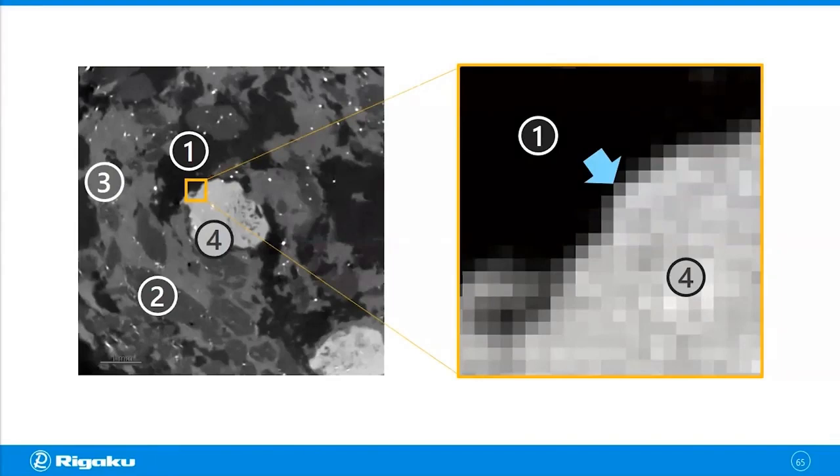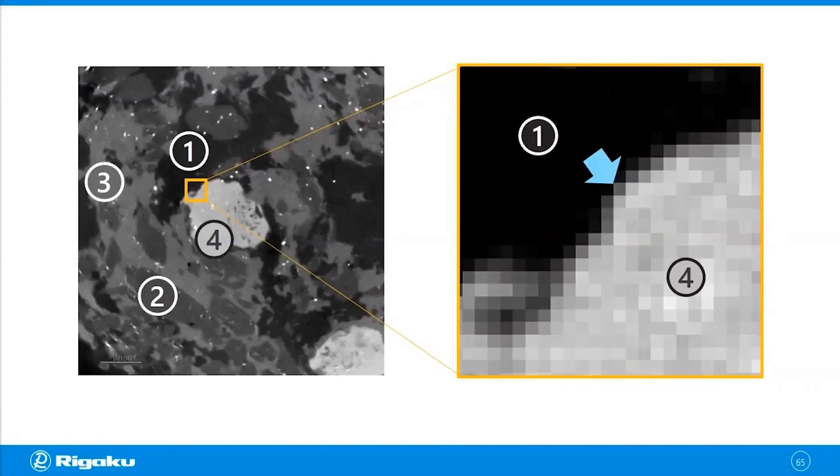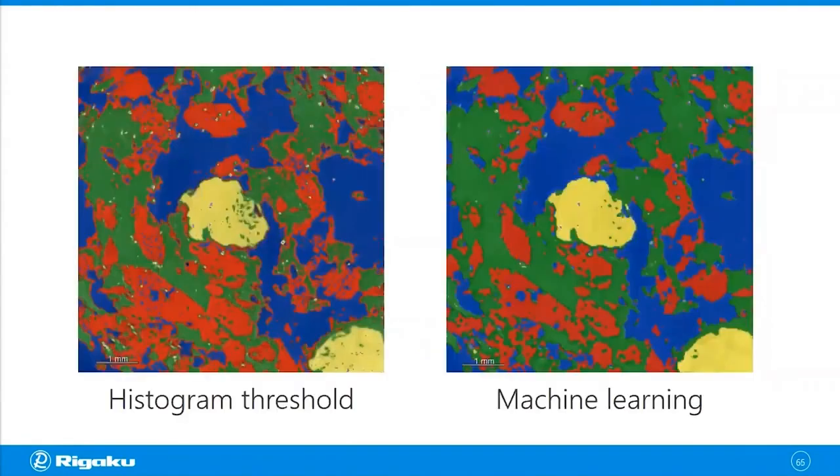But in this case, we have phase three and phase two that are kind of in between gray. And that's why those phases two and three will show up in the interface as this artificial frame. And that's how you get those frames.